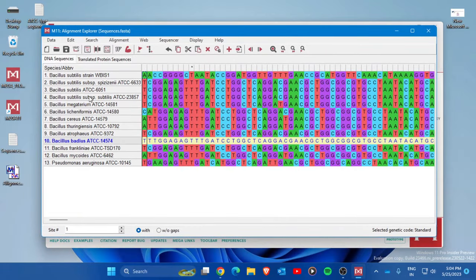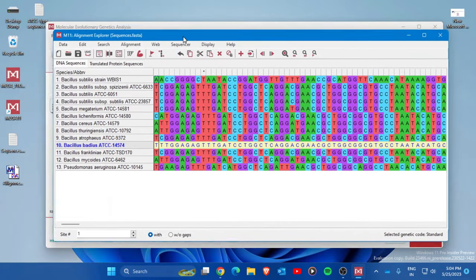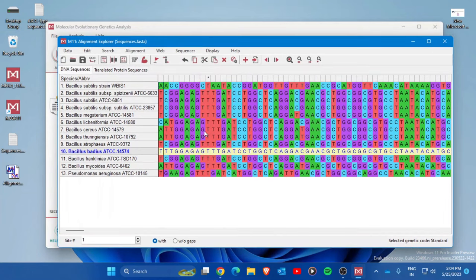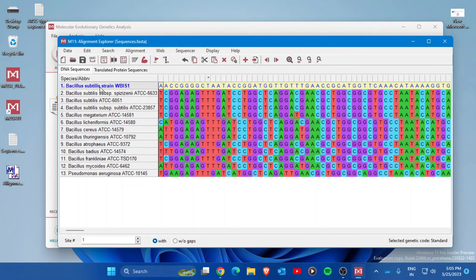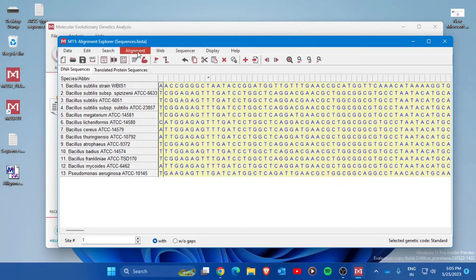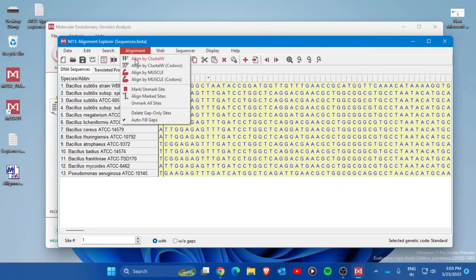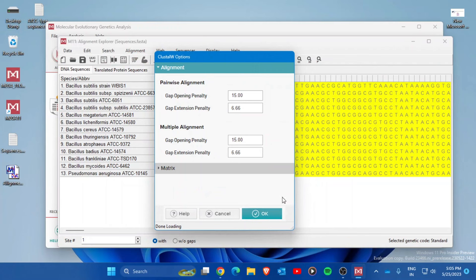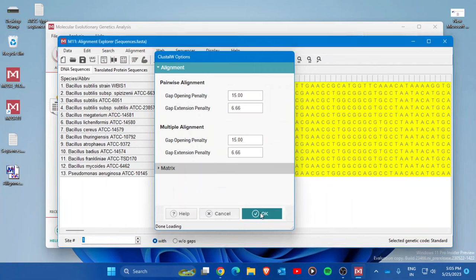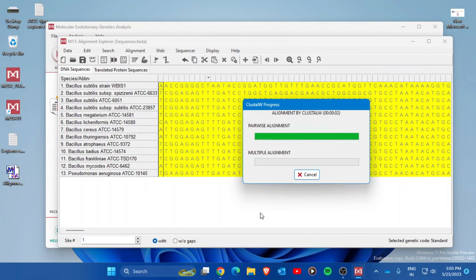All the sequences are now loaded in the alignment window. Next, go to the Alignment tab and select all sequences by pressing Ctrl+A. Then go to Alignment and choose 'Align by ClustalW'. Keep the default settings and press OK. The software will now perform the pairwise sequence alignment.